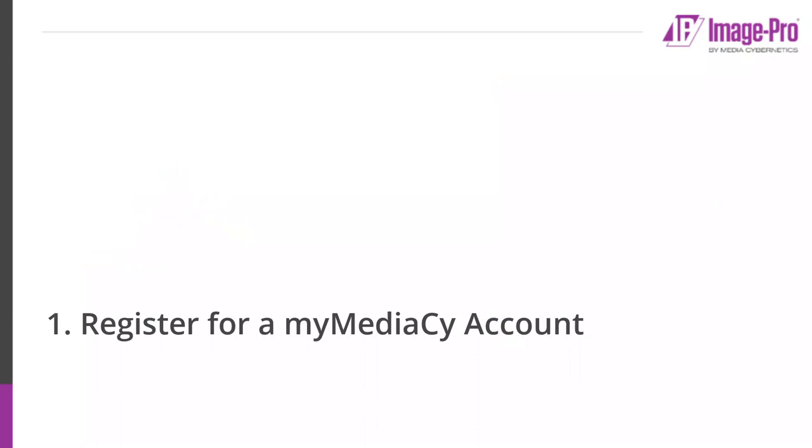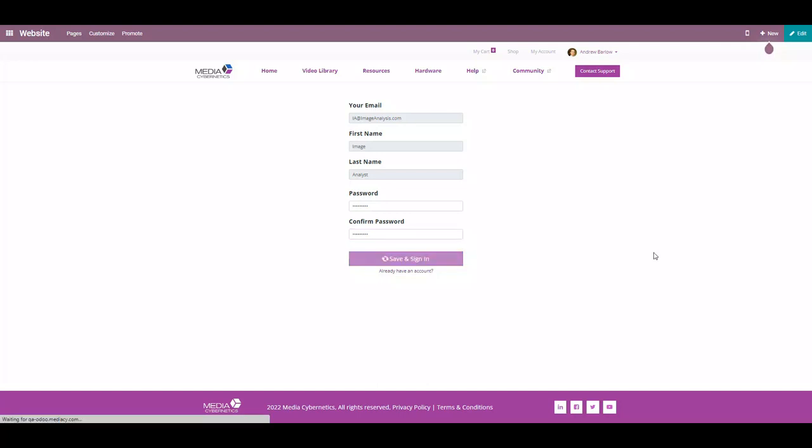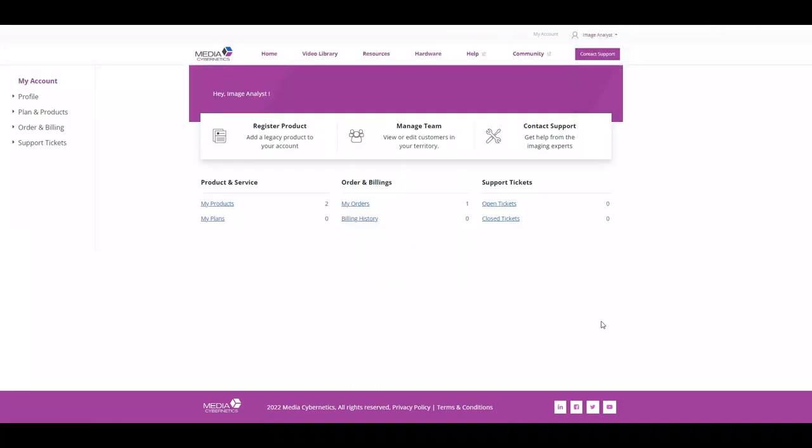Your first step is to register for a My MediaCy account. Follow the link in the email that you receive from Media Cybernetics. You'll be asked to complete some missing information fields. The fields that you need to complete will depend on the type of account that you're setting up, so you may not see exactly what is shown here. We do request that you complete any essential fields and sign into your account. You now have access to the My MediaCy portal.